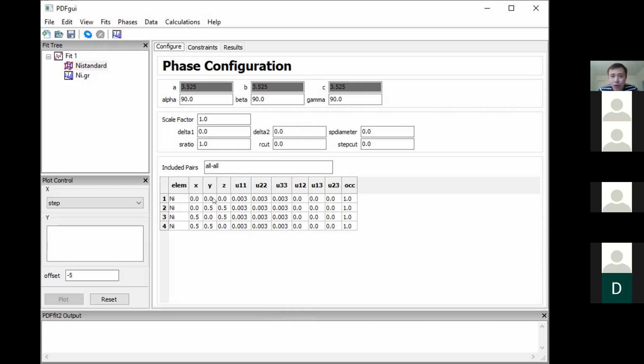And that's why we prefer to use nickel as a standard, because you have only very few parameters to care about for the nickel material itself. One parameter for lattice dimension. You have no parameter to care about atomic position. Some B value to care about, so only 1 and 2, right? You have only 2 parameters to care about for the structure. And all the other information can be used to the advantage of fitting the instrument part.